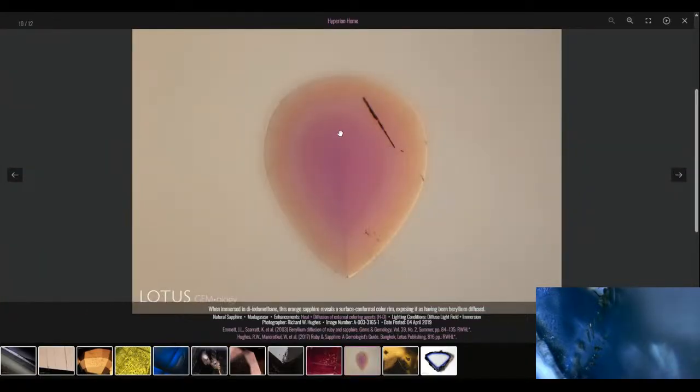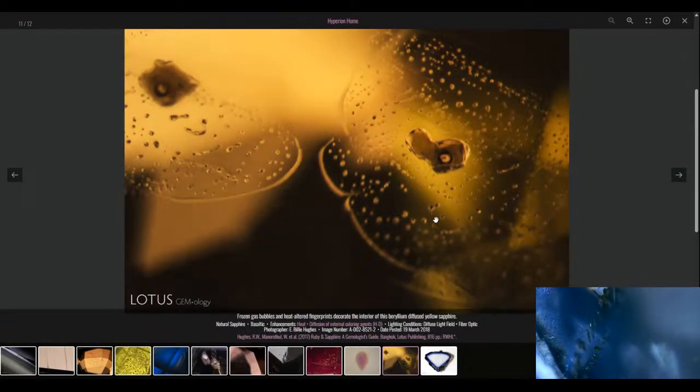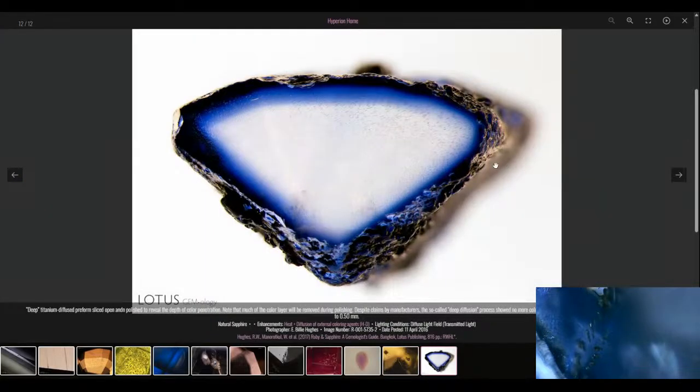Here we can see the center is pretty colored, and then on the outskirts of the stone, it's orangey. Interesting. So the deeper the stone is, the deeper the color is, and it's lighter on the sides because there's less diffusion there. It's less stacked color, I guess. Here you see it. That's a snowball type of heat treatment. Snowball inclusion. Interesting. That's pretty cool to see. Diffusion only on the outside of the stone.